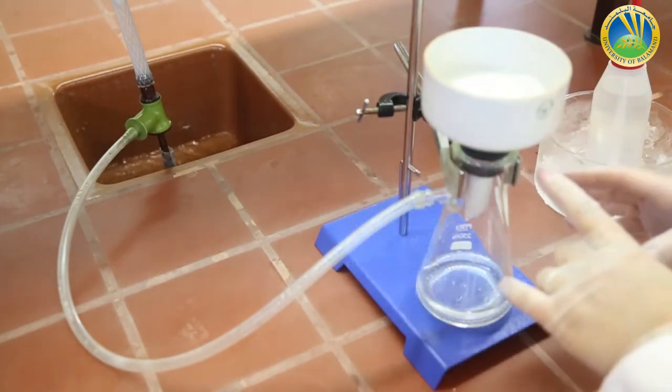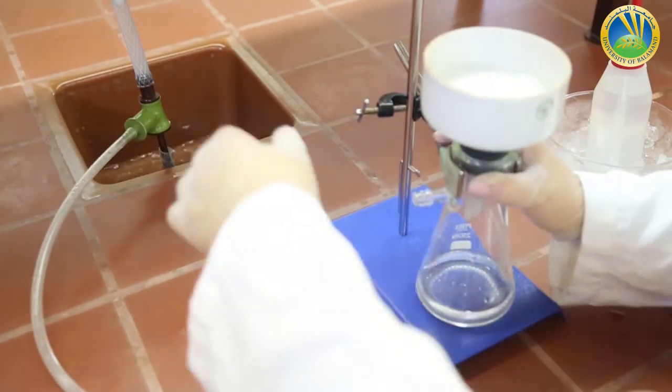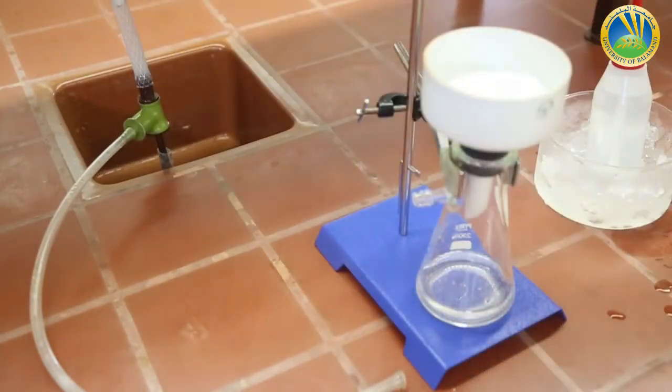To stop the filtration I have to break the vacuum first, and then turn the water off.